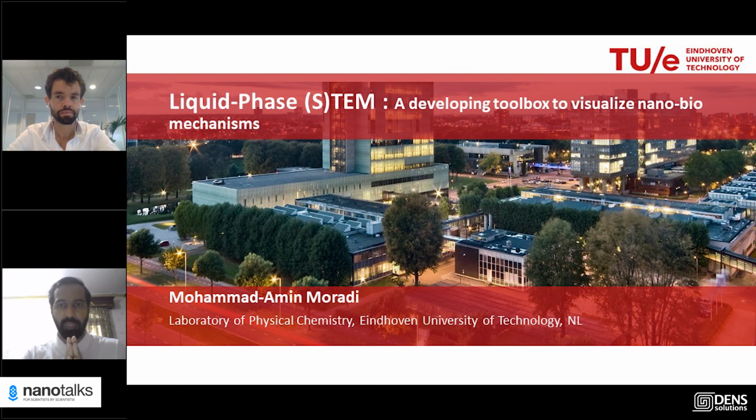One of the very advantages we found is that when you want to follow a reaction in a liquid cell, and the same for graphene liquid cells, you need to make beaming time periods, and then when the beam is off, your reaction will go on apart from the beam damage. You give the chance for the accumulation of energy and electrons in your system to go away, for which graphene is a good option.